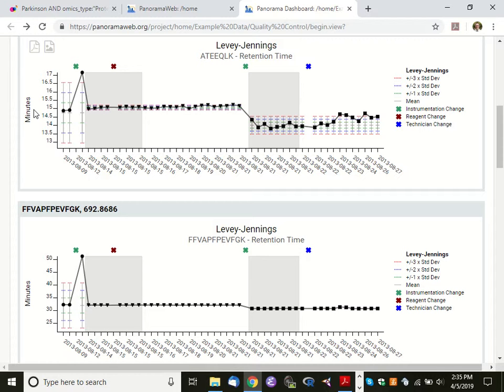In fact, there's only one amino acid here that's really strongly hydrophobic, and that is leucine. Leucine is a branched hydrophobic, so it's pretty sticky for those beads. But the other residues are not. The other thing I'd point out, it's a short peptide. Short peptides in general stick a little less well than long peptides to these columns.